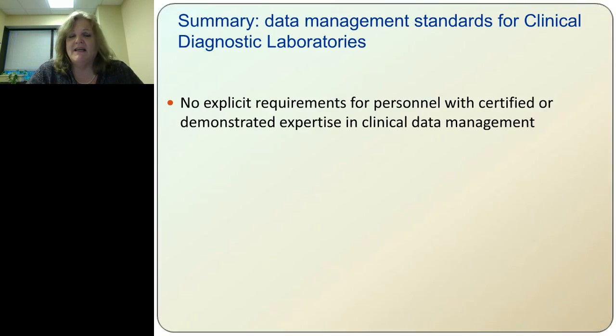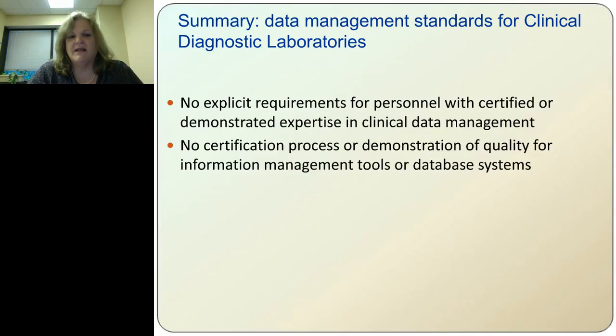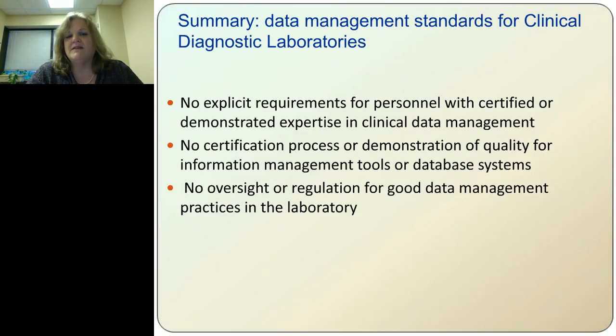that I've been able to see, any kind of requirements for people to have some sort of certification in SQL or laboratory information management or HIPAA, or the people who actually handle this data, including the LIMS manufacturer. There's no certification for the people that do handle the data. There's also no certification process for the information management tools or database systems. There is no certified LIMS system that could be used in a clinical laboratory. That's, again, completely on the shoulders of the lab.